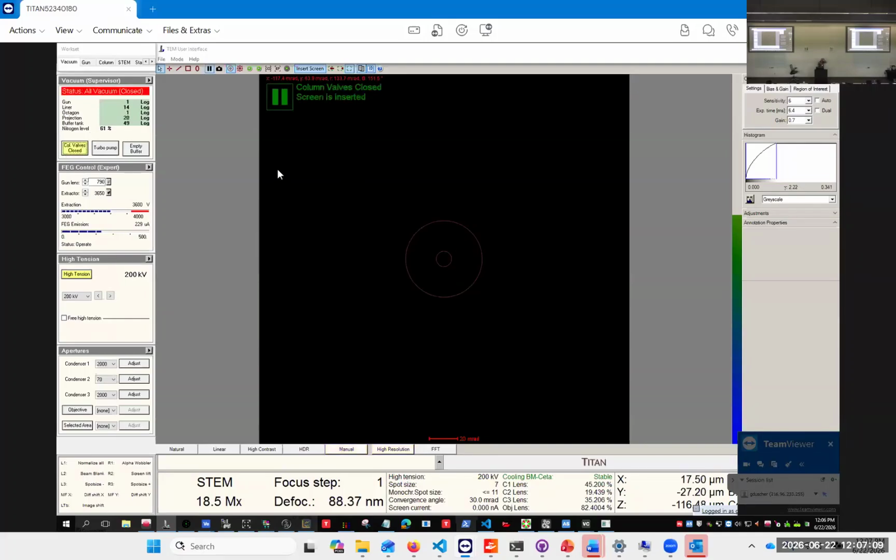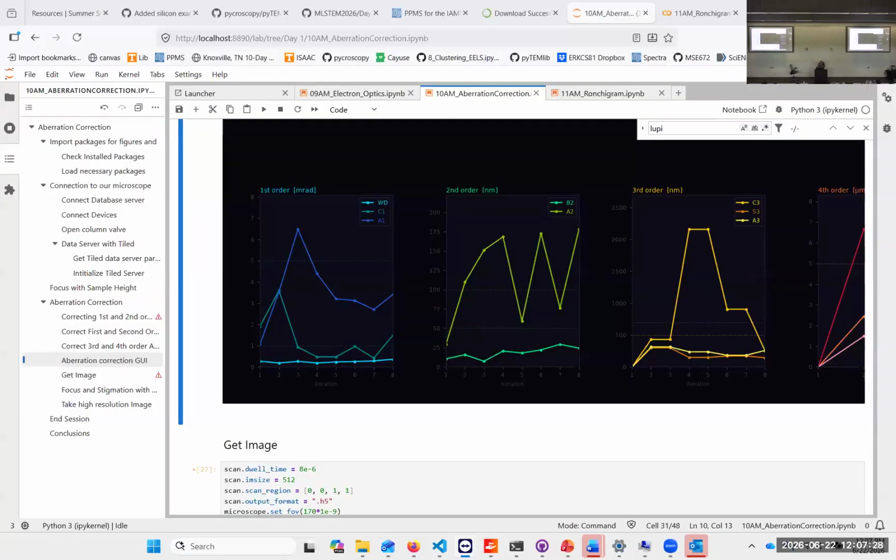So that much from the microscopy part. And once you have a good beam, you can just raster over it and you get nice images. So we did that already. Thank you. Any other questions here? We don't have any. So, oh, there's another one in the chat.